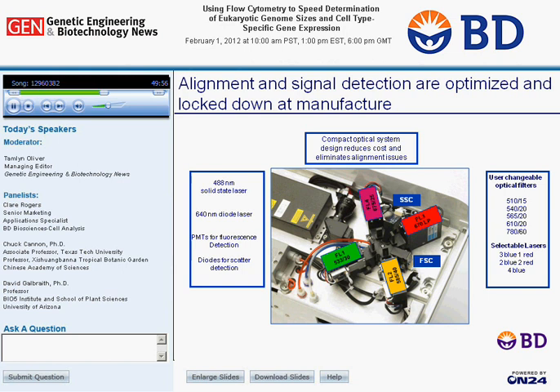The optical filters that come standard in the system are listed there on the labels I've placed on top of the photomultiplier tubes. They're optimized basically for FITC, PE, and PerCP-Cy5.5 for FL3. FL1, 2, and 3 are going to read fluorescence due to blue laser excitation. FL4 is dedicated to reading emissions due to red laser excitation, and the standard filter that comes with it is optimized for APC detection. But there are optional optical filters available. Those are listed over on the right-hand side, and so for specific applications, one might want to choose one of those optical filters instead of one of the standards.